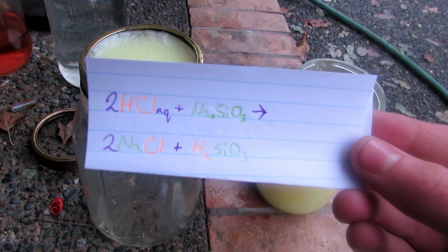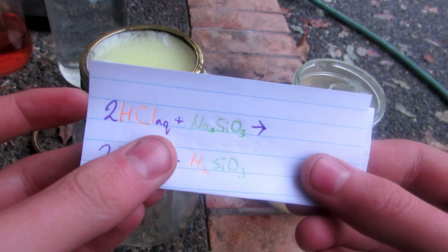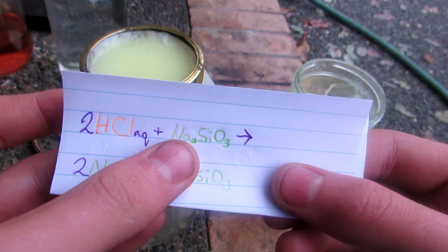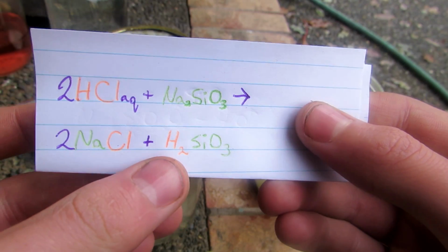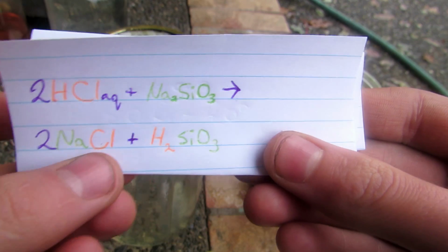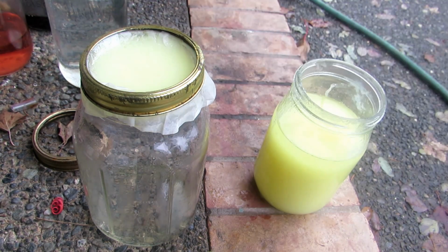Now, the reaction that happened before was as follows. So we have 2 HCl, which is aqueous hydrochloric acid, plus sodium silicate, which gives us 2 NaCl, sodium chloride, and silicic acid, H2SiO3. So this appears to have precipitated out quite well here.